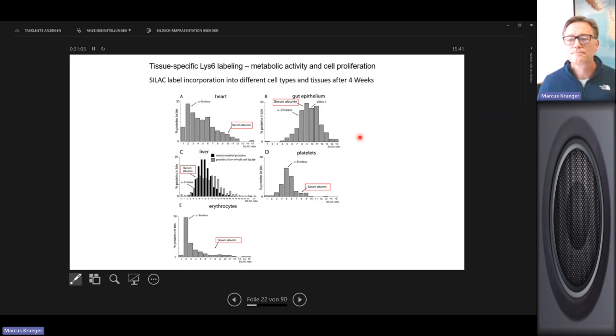Yeah, sure. Thanks for your talk. How do you handle the loss in coverage induced by using SILAC or other multiplexing methods? Of course, that's not a problem, but it's a valid point. We increase the complexity of our samples, right? Since we have a light and heavy peak, we have to sequence both of them. So we get an overall reduced number of proteins.